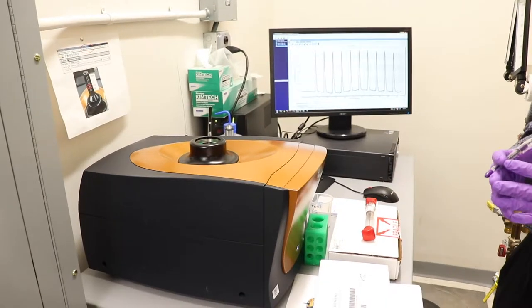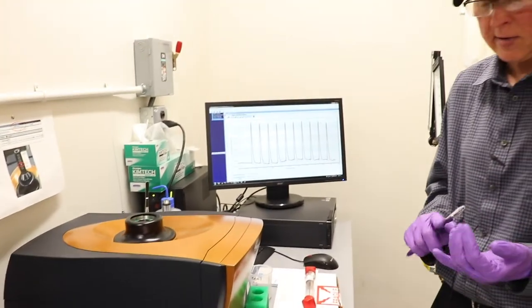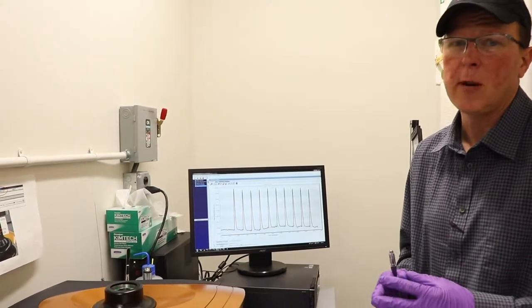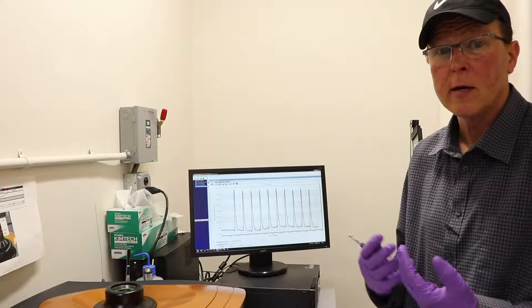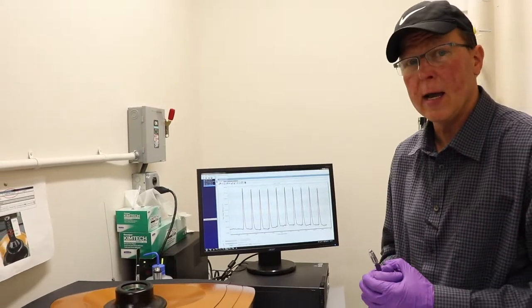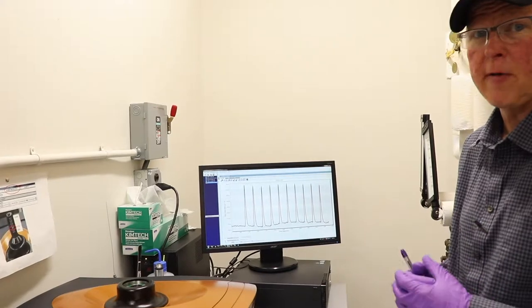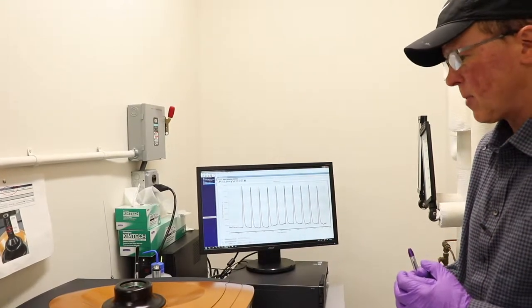What's nice about the nano ITC is between the sensitivity of the instrument and the ability to use a very small volume, you can get a lot of information with a small amount of protein sample and be able to do more experiments with what is often a limited amount of sample that you might have.